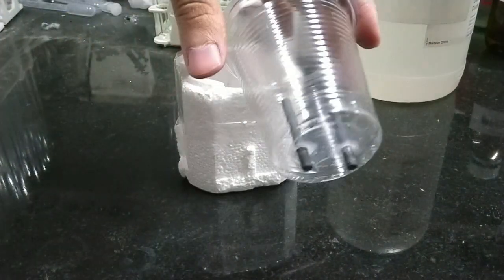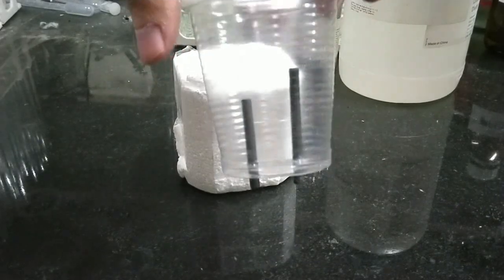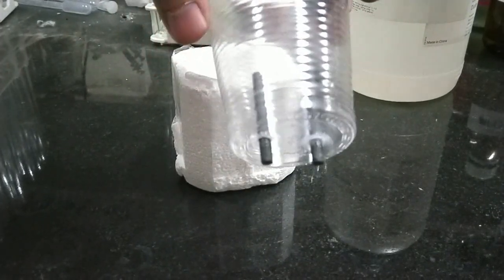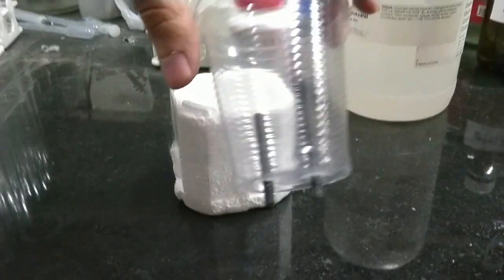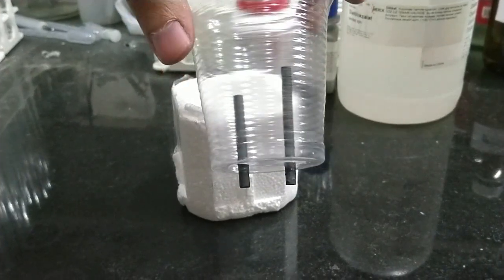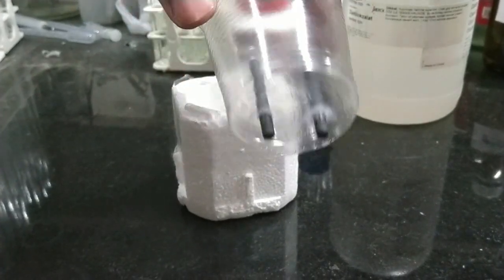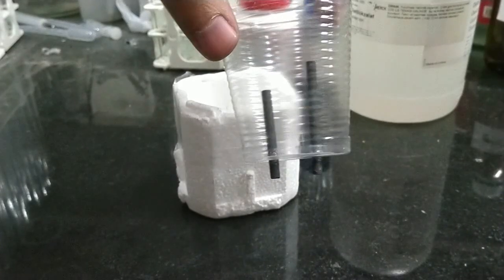Here I have made a simple electrolytic cell using two graphite electrodes I have obtained from AA batteries and a little plastic container.